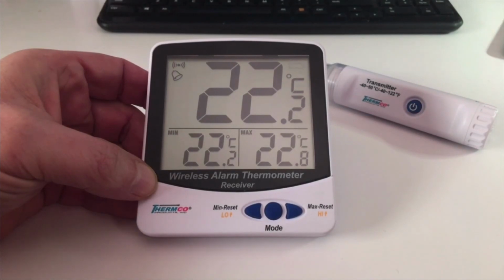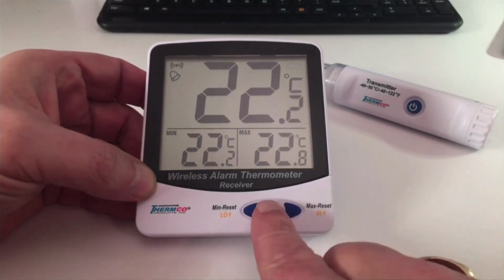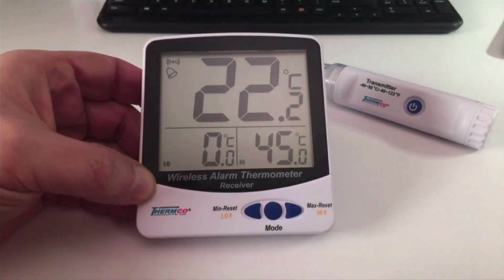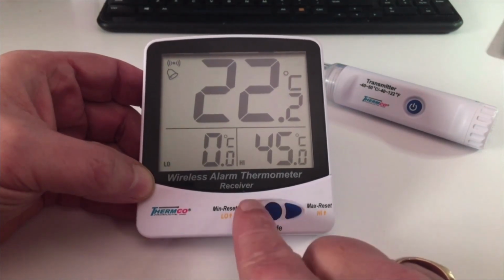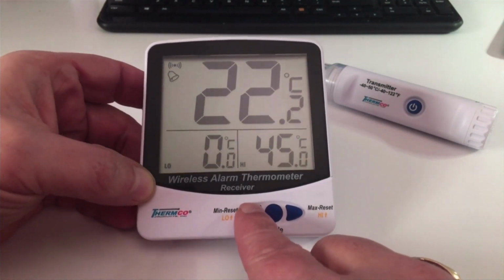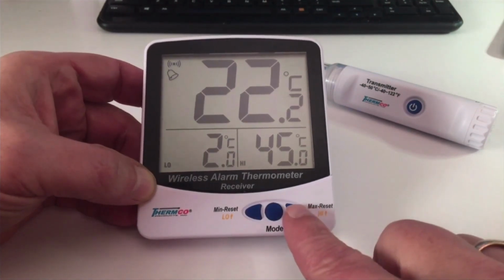Okay, now that we're receiving temperatures from our wireless probe, let's set our alarms. Press the mode button, and the display will change to low and high in the lower section. The button marked low will set our low alarm setting. I want 2 degrees, so I'll just hit this 2 times. And I want a high alarm of 8 degrees.